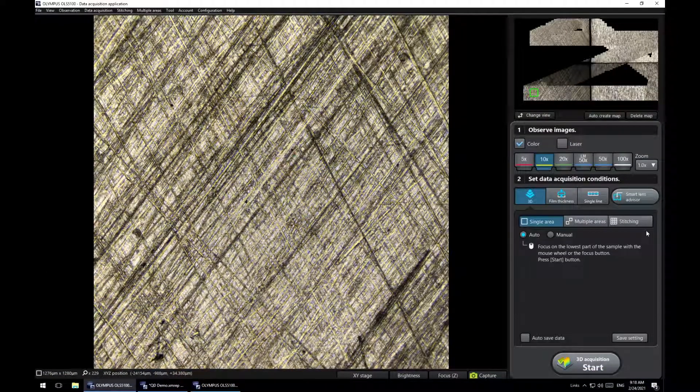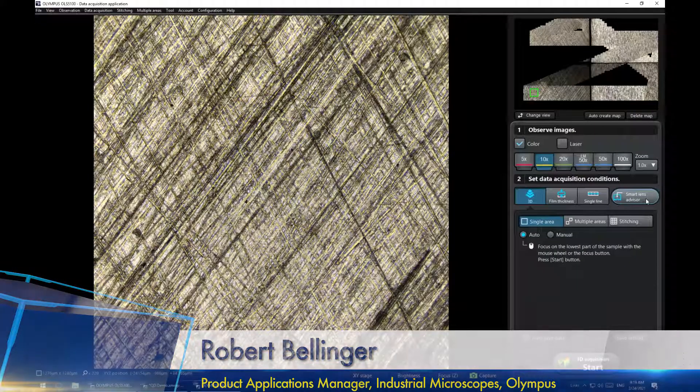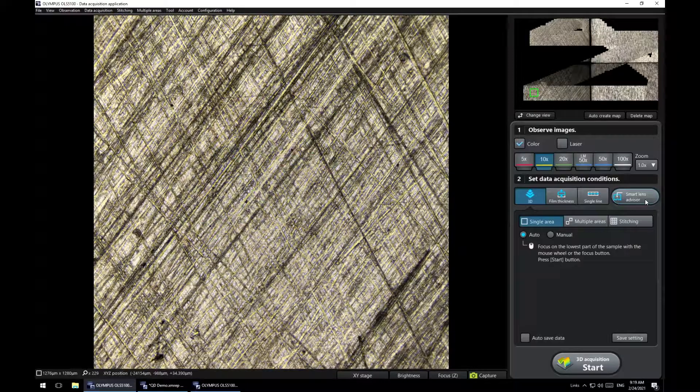We definitely want to show a couple of the new features in the software. Right off the bat, in our acquisition software, everyone would see a new feature called Smart Lens Advisor. In the past, a lot of questions came up — especially when people were doing surface roughness testing — asking whether they needed the highest magnification objective or could use a lower mag for a larger field of view and still get accurate results.